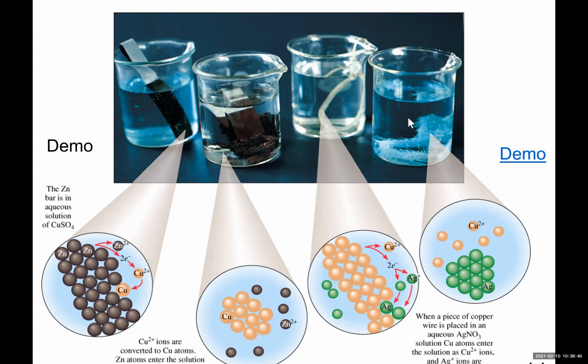Do you see these crystals? A single layer formation of silver crystals, and now overnight they are growing. So what happens to silver ion? It makes silver metal overnight. What happens to copper? The copper wire is losing electrons and is becoming Cu+2. Remember, the blue color of Cu+2 dissolved in water is appearing overnight.